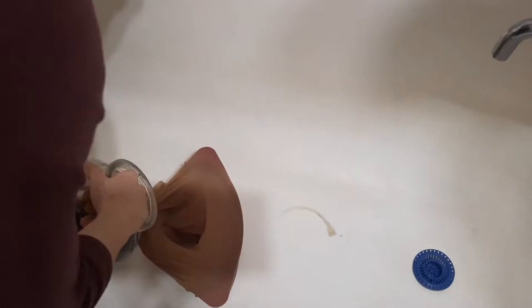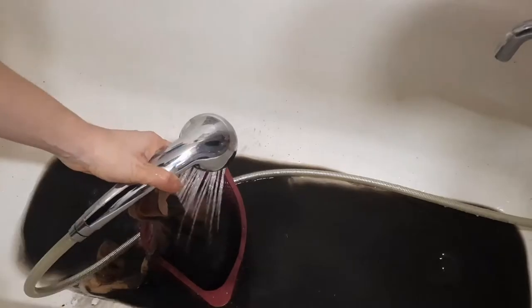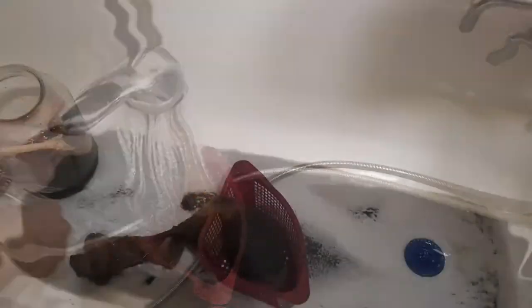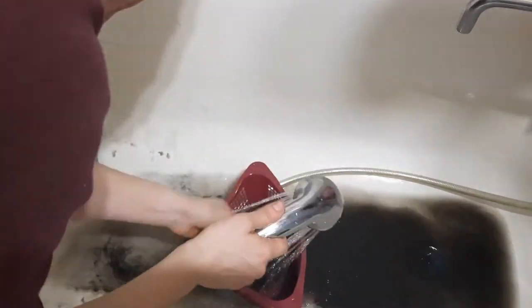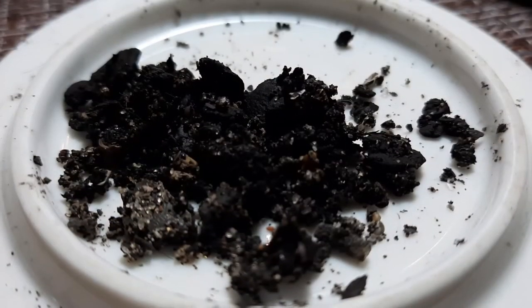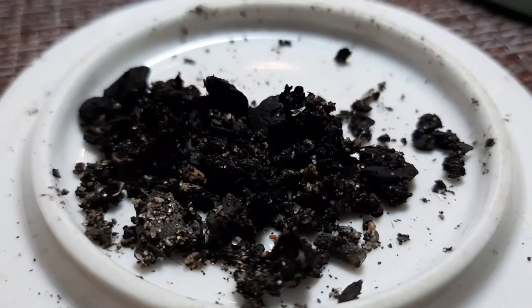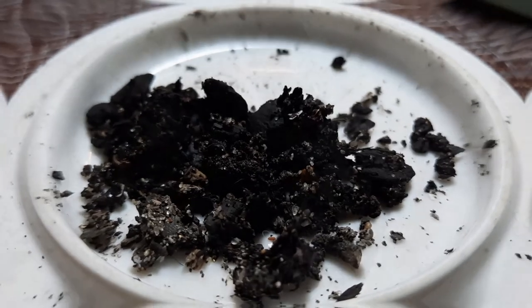Фораминиферы очень важны и используются в качестве биоиндикаторов температуры, солёности, кислорода, мутности воды. Это очень важно при определении изменения климата на планете, потому что эти организмы очень тонко реагировали на смену условий окружающей среды. Вот такой вот мусор получился у нас после промывки. И вот теперь мы будем разбираться, есть ли в этом мусоре фораминиферы или их там нет.